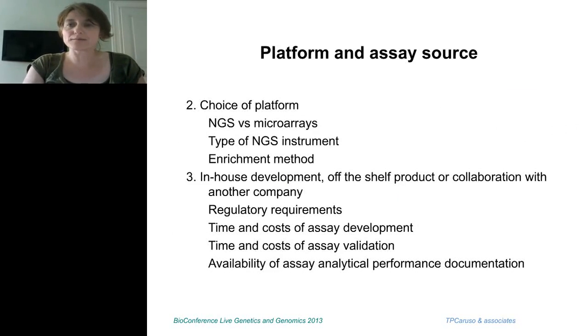So choosing the platform here, it's not just next generation versus microarrays. That's the important thing that I've been focusing on here. But once you decide either on microarrays or next gen, you need to decide on the instrument type. So even with microarrays, whether you're going with the cartridges or the strips or plate type assay.